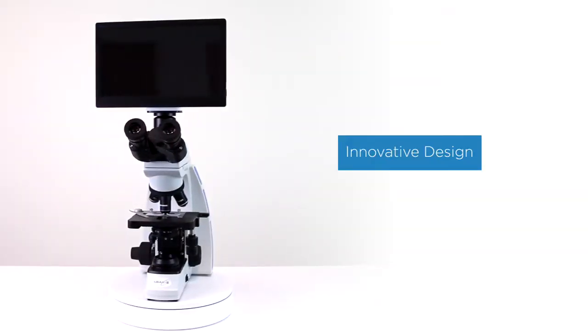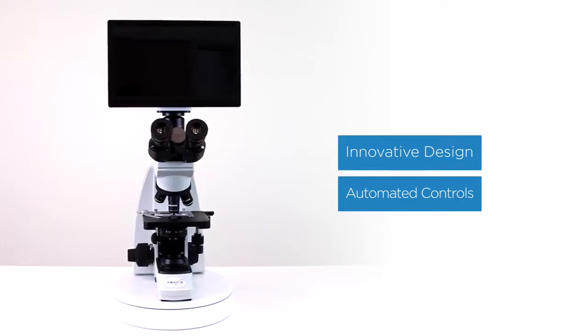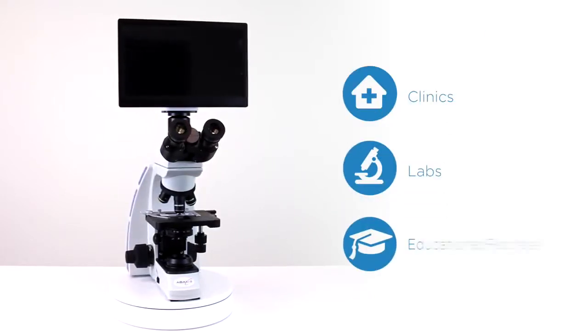All this, combined with its innovative design and automated controls, makes it ideal for all clinics, labs, and educational facilities.